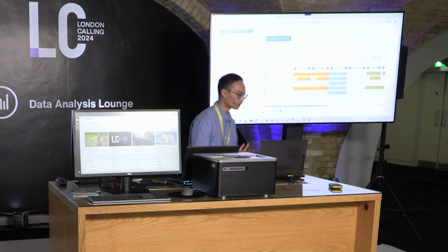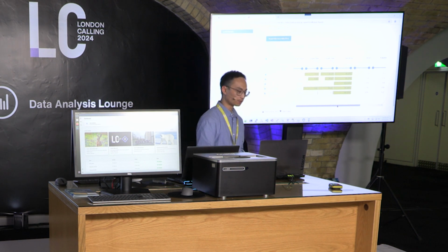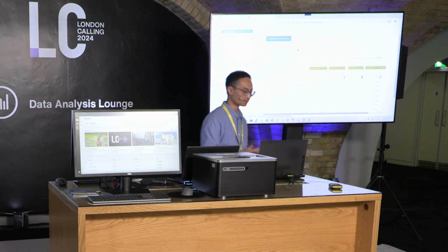And so here we can actually see, not only do we get the total sequencing output, if we scroll over to the right, it also reports the microbial composition of your samples. And if we switch over to the second tab, you can actually see the taxonomic classification at the individual species level. And you can see that majority of these reads are in fact Salmonella.